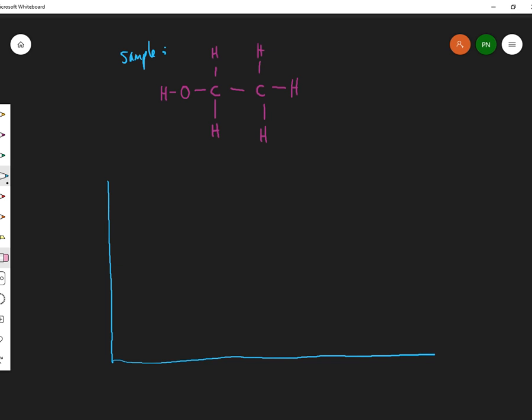Okay, now, this way, in this direction, the frequency increases. So how do you spell frequency? Frequency increases. Now, if I could be with you, I'd explain why the frequency increases this way, and it's quite interesting because in the old days, these recorders used to just be a pen going up and down, and the paper used to move, and the pen just went up and down.